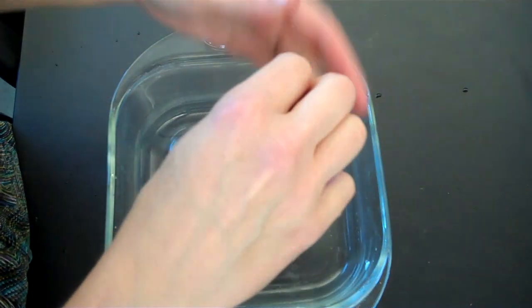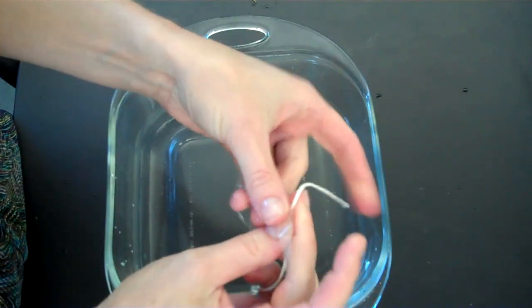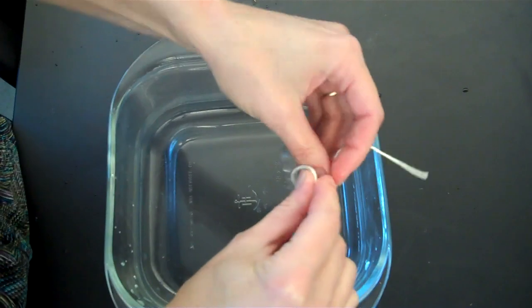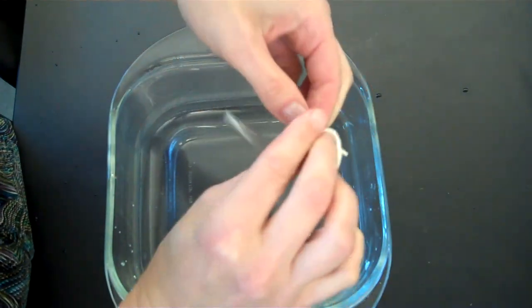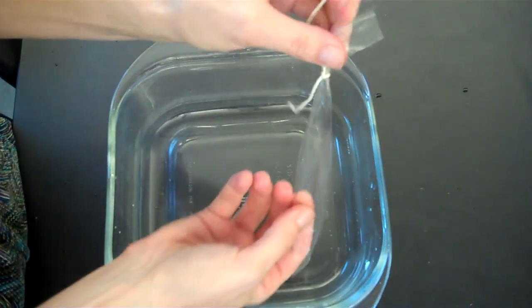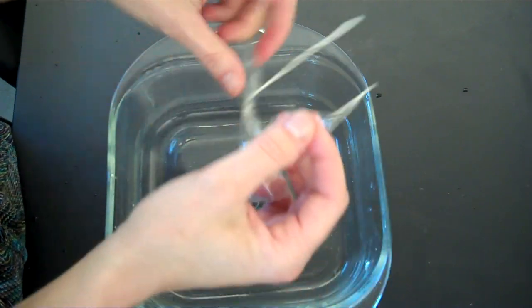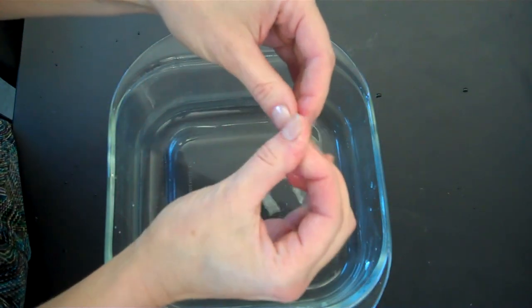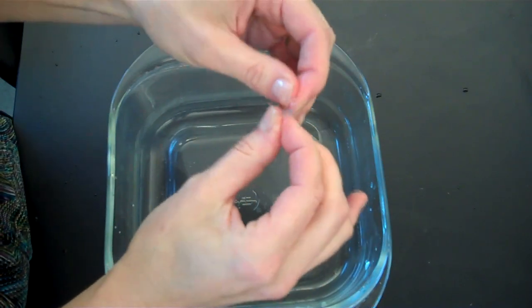The first thing that you're going to need to do is to tie one of the ends of the piece of tubing. And now that one end is secure, you need to open up the other side. So this is a tube, so if you rub this between your thumb and your forefinger, you'll see that it will open up.